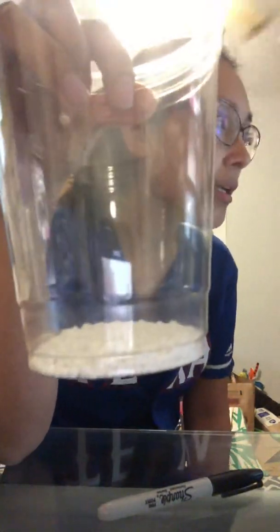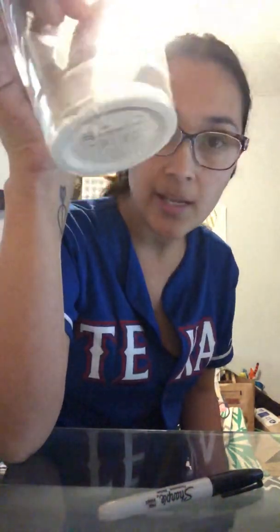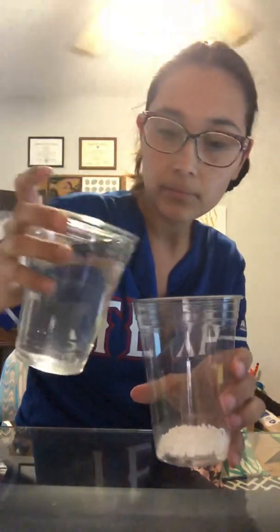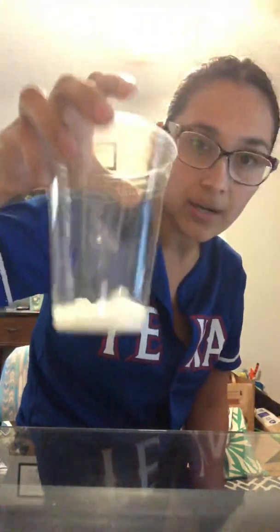Okay, so then we're going to do observation mixing with water, and I'll tell you what I'm feeling and seeing and smelling. The first thing we're going to do is mix this with a little bit of water. So we're going to mix. You can see it is bubbling. You can kind of hear it.